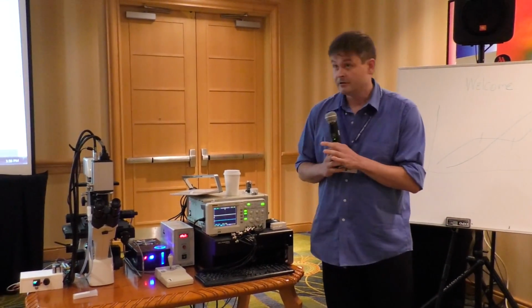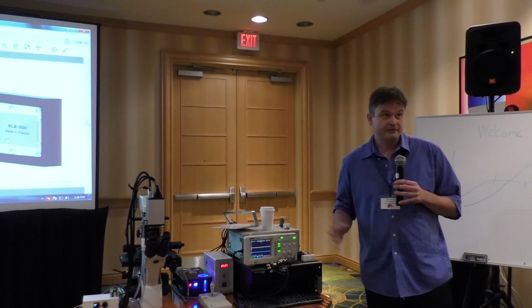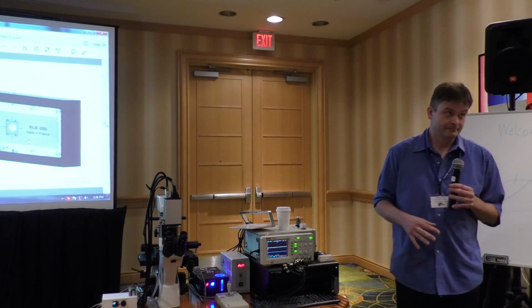But there is some movement coming. Zeiss in France has been running a prototype test for the last year with a company called Argolite. We've discussed the standard. It's not that easy to use, but it's a pretty nice standard. The only problem is it has a $5,000 price tag. So you still need to know what you're doing. Leica and Zeiss in Germany are talking about a German industry norm, how to avoid it, and if you can't avoid it anymore, what to put into it.